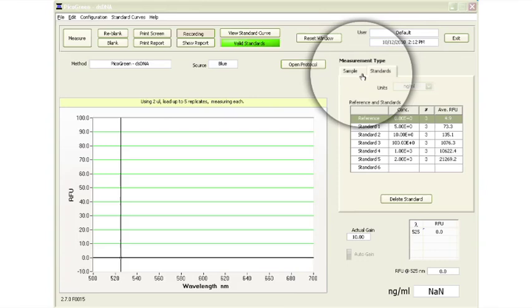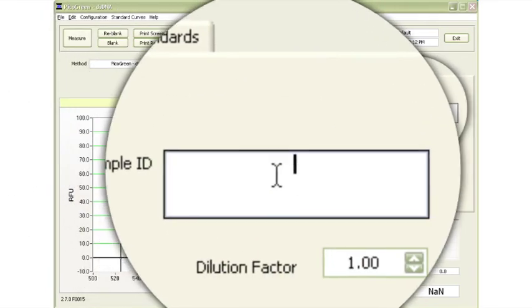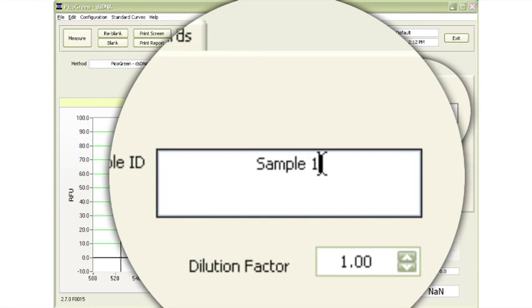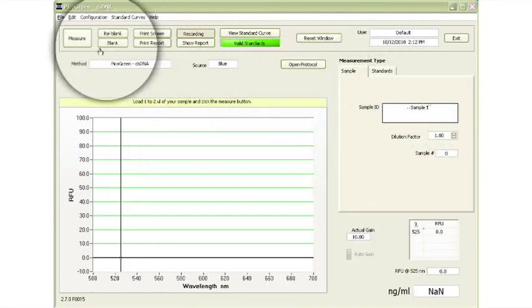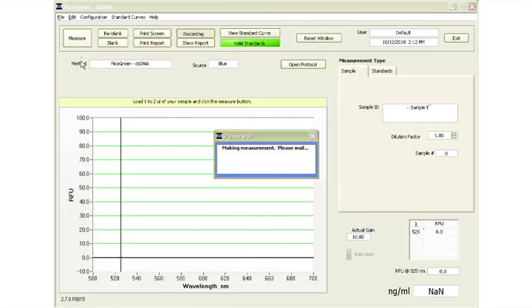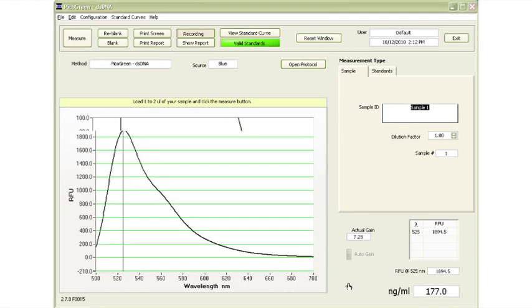Once the standard curve is complete, select the Samples tab, enter the respective sample ID information, and measure each unknown sample. A valid curve indicates that the minimum number of standards has been met. The DNA concentration is automatically determined based on the standard curve.